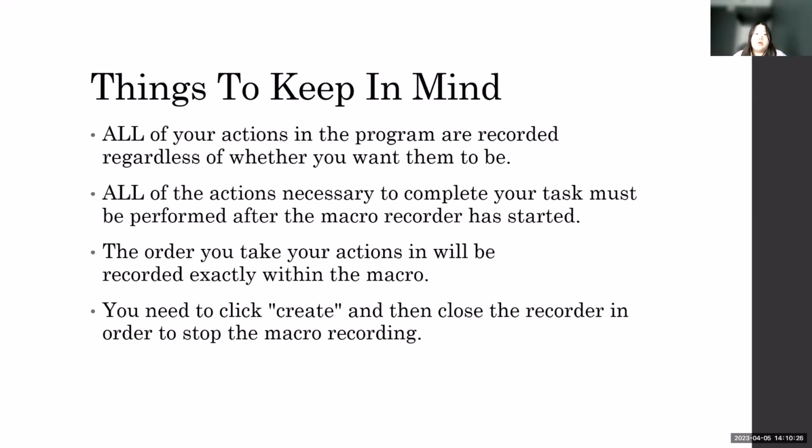And the macro will perform your actions in the order that you took them. So it will not do a different kind of order or start from bottom up. And also as a reminder, you have to press create and then close the recorder in order to stop the macro from recording all of the other things that you're doing that you don't want.